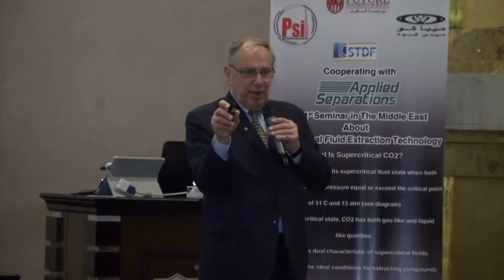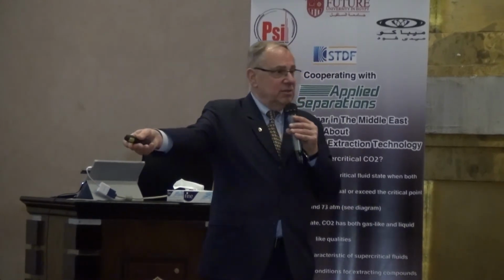One of the things that you can do with supercritical CO2 is you can pick the solvating power to optimize the compound that you're looking for and leave behind what we call co-extractables. So selecting that is exactly what happens. And as a consequence, you wind up with a better product. Exactly as Dr. Mukhtar had pointed out as well.